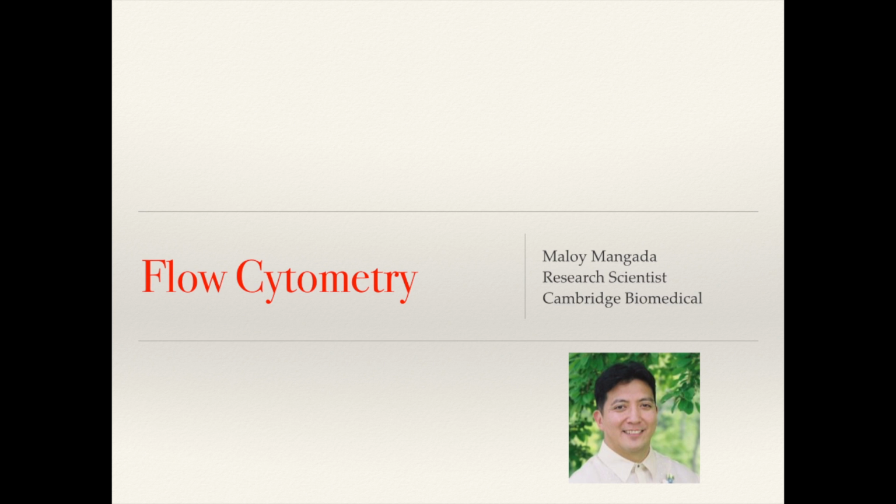Hi, my name is Malloy Mangada and I am a research scientist here at Cambridge Biomedical. I have 15 years experience in flow cytometry and more than 20 years experience in a clinical lab.